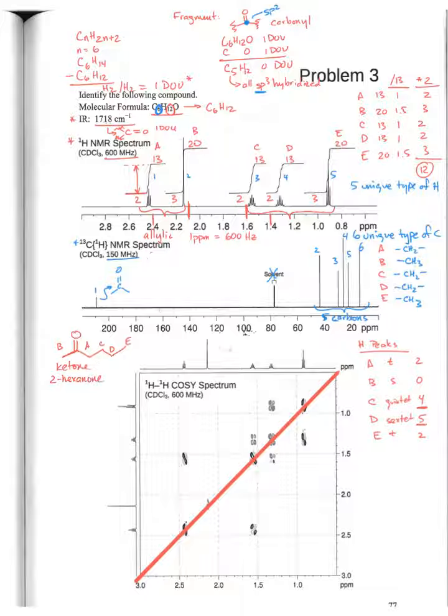So even though we have a structural claim at this point, let's go ahead and look at this 2D NMR data so that we can understand how this helps us basically give confidence to the structural assignment we've already made. So let's first look at the HH COSY spectrum here. I'm going to write in those arbitrary assignments that we've made already. And that's just A, B, C, D, and E, reading from left to right.